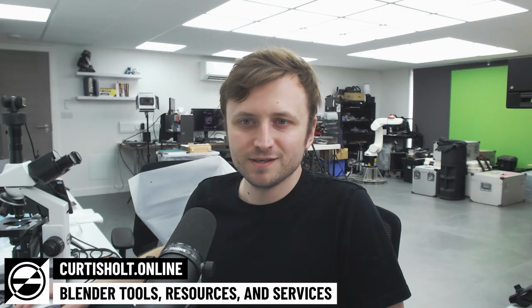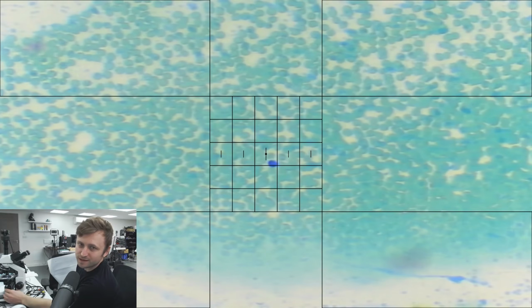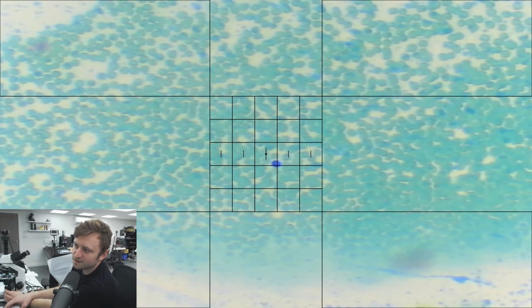All right, hello everyone. Huge news. I don't know if I've mentioned this anywhere else, but I have successfully, finally, managed to stain and observe my white blood cells. This was something that I've wanted to do for ages. As we can see here on the screen, this is a lymphocyte.